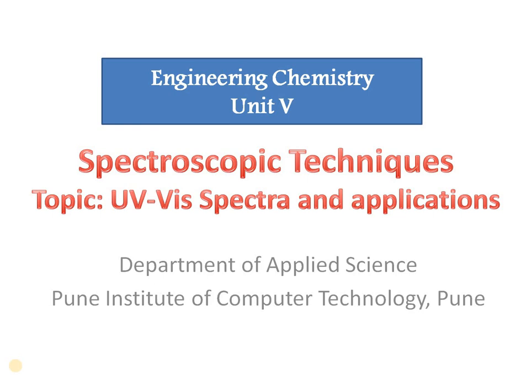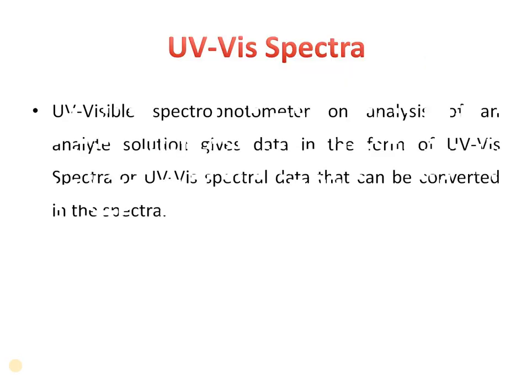In this session, we are going to discuss UV visible spectra and applications of UV visible spectroscopy from Unit 5, Spectroscopic Techniques. So, what is UV spectra?